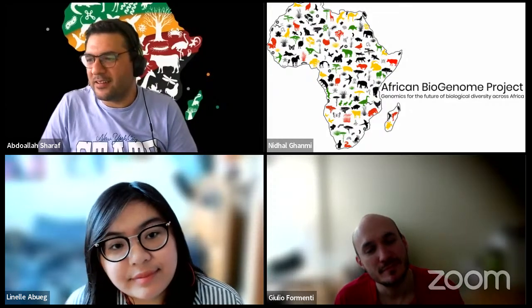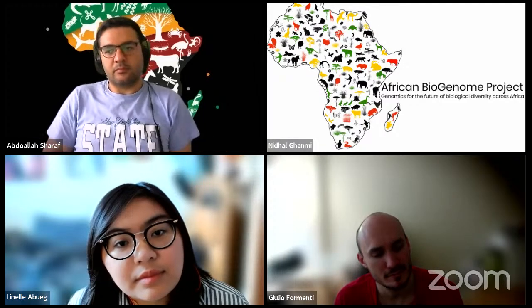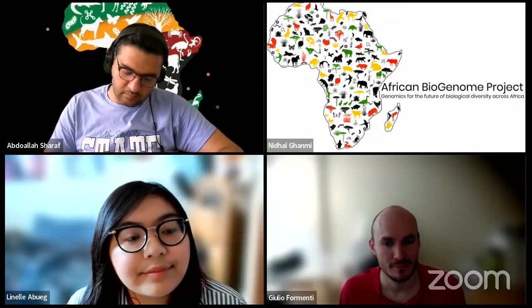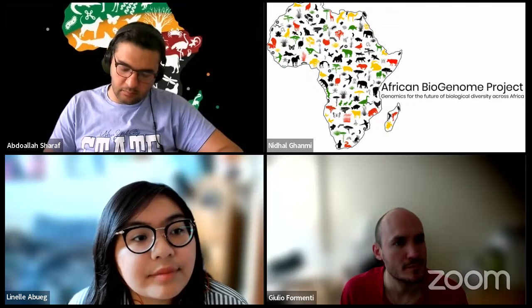I enjoyed the presentations. They're quite good, especially Inel and Giulio. What I just want to ask is about the context. Lina had said that when it is haploid, you have one peak, but if it is diploid, you have two peaks. Does it mean that the number of peaks has a direct bearing on the ploidy level, in which case, if it's triploid, we possibly expect a third peak? Then what happens? Because I seem to see that the two peaks are not equal. Does that mean variation in the DNA coming from the two parental lineages? How can one interpret that difference in the height of the peaks?